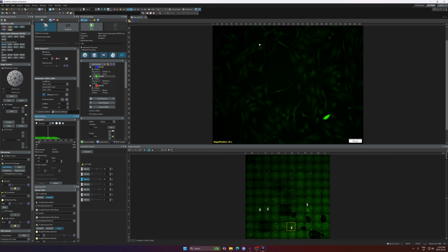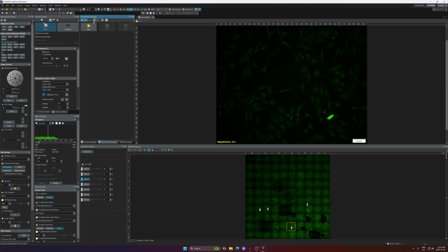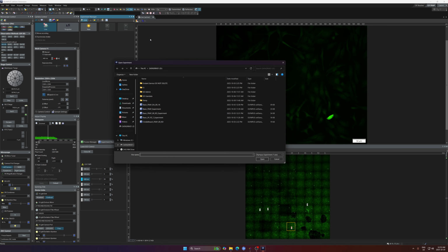Unfortunately, for this kind of experiment you have to go through something called an experiment manager. This is a very complicated interface, almost like script writing, and we created some basic templates to start with. Again, you go to load experiment, and there's some basic FRAP. That's basically DAPI, green, and I'm not sure what the other one is, but I will start with the basic FRAP here, and we'll have some other different configurations. Click bleach. So let's just start with this one, and just load, open.